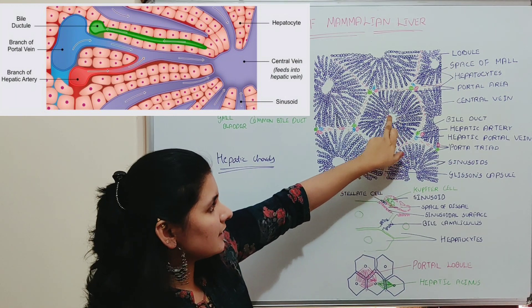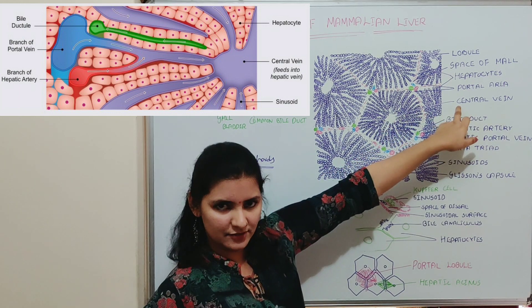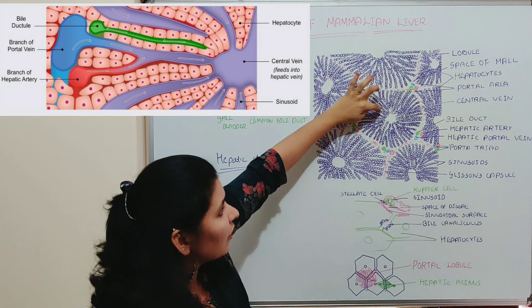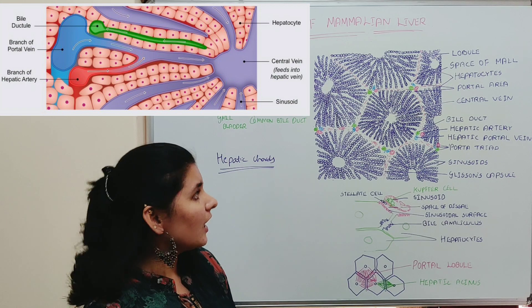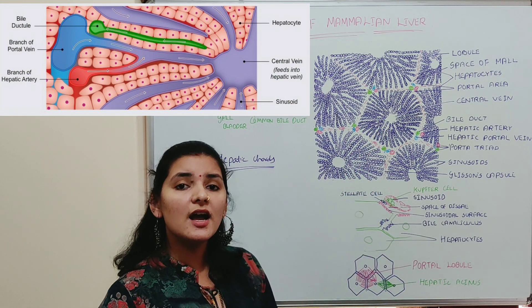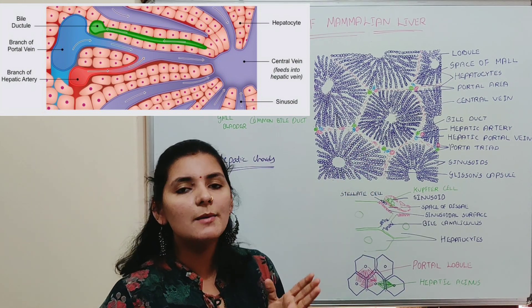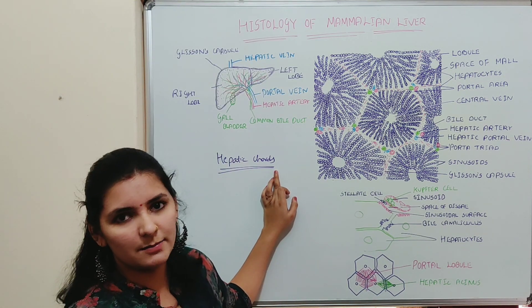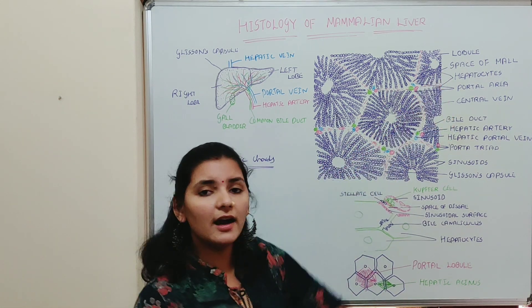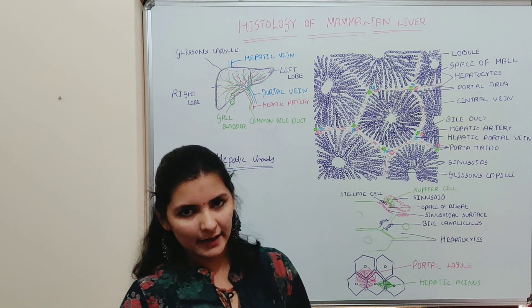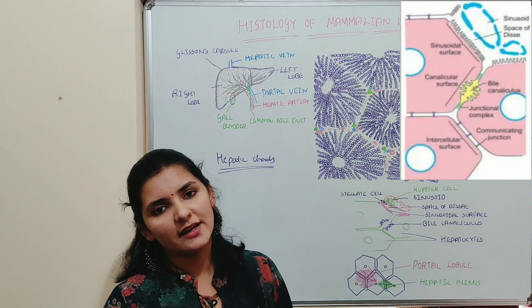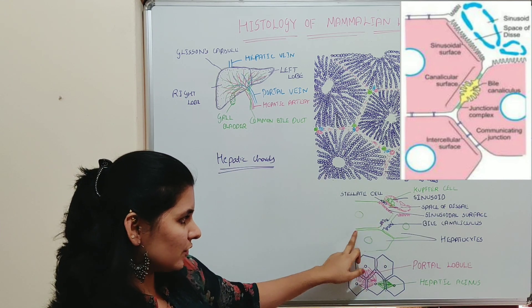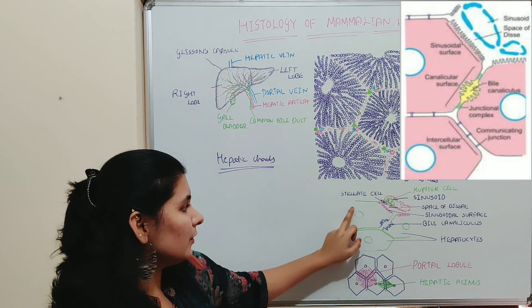These hepatic cords are arranged in a radiating fashion from the central vein. The vein present at the center of each lobule is known as the central vein. The hepatic cords radiate from the center to the periphery, are arranged in one or two cell thickness like bricks of a wall, and are the secretory parts of the liver — these hepatocytes are the ones which secrete bile juice. Individual hepatocytes are cuboidal or polyhedral in shape.